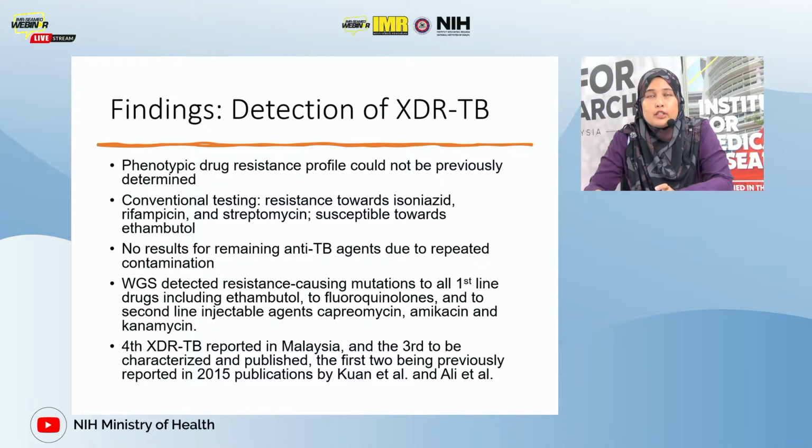One of our findings was the detection of an extensively drug-resistant TB. This isolate showed phenotypic drug resistance towards isoniazid, rifampicin, and streptomycin, and susceptibility towards ethambutol. No results for the remaining anti-tuberculosis agents were obtained due to repeated contamination.